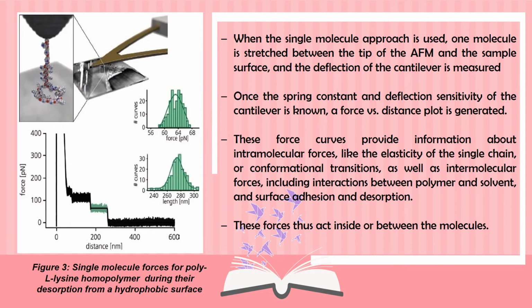When the single molecule approach is used, one molecule is stretched between the tip of the AFM and the sample surface, and the deflection of the cantilever is measured. Once the spring constant and deflection sensitivity of the cantilever are known, a force versus distance plot is generated.